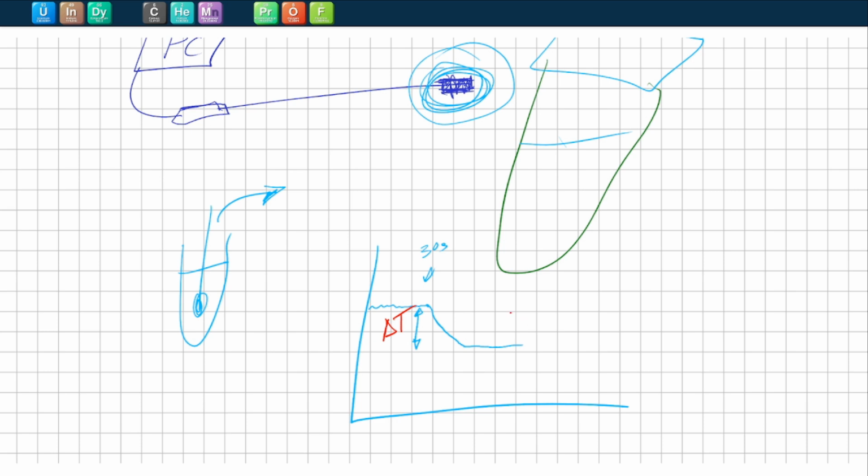So this is the basics of the experiment today. We're going to create this temperature probe wrapped in filter paper. We're going to soak it in liquid, and we're going to see how much the temperature drops as the liquid vaporizes. We're going to have two temperature probes going at the same time because there's a number of liquids, and we're going to make sure they start at the same time. So you're going to have two different graphs going at the same time.